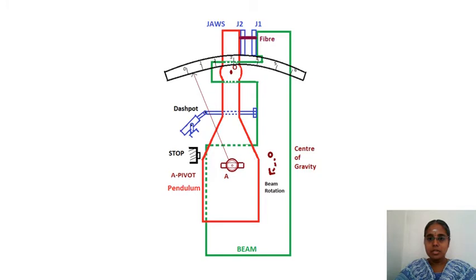I have told you we have to check during calibration. This scale has to be noted. The loading rate has to be noted in this scale. For 7 seconds, it should move till 7 kgs. I have shown only till 6 kgs. It is actually till 8 kgs in the instrument. 1 to 7 kgs are the apt ones.